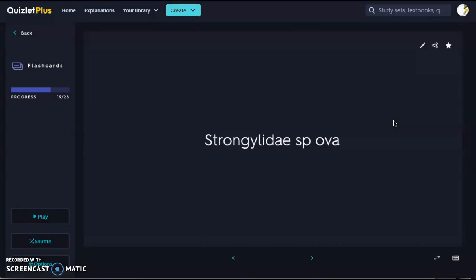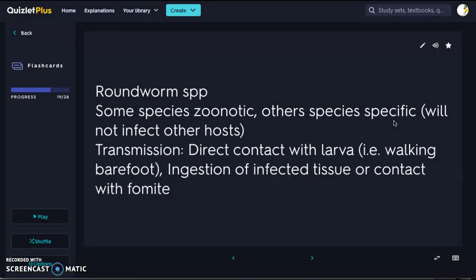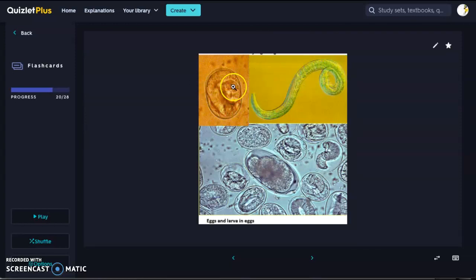Next we have Strongylidae — another roundworm species and actually the photo that was in your bellwork not too long ago. Some species are zoonotic; others are species-specific. Transmission can be direct contact with the larva — for example, walking barefoot with a cut — ingestion of infected tissue, or contact with a fomite, so it's easy to spread to other animals. The ova have a very thin membrane with an oblong shading in the center, shown here at different stages of development.